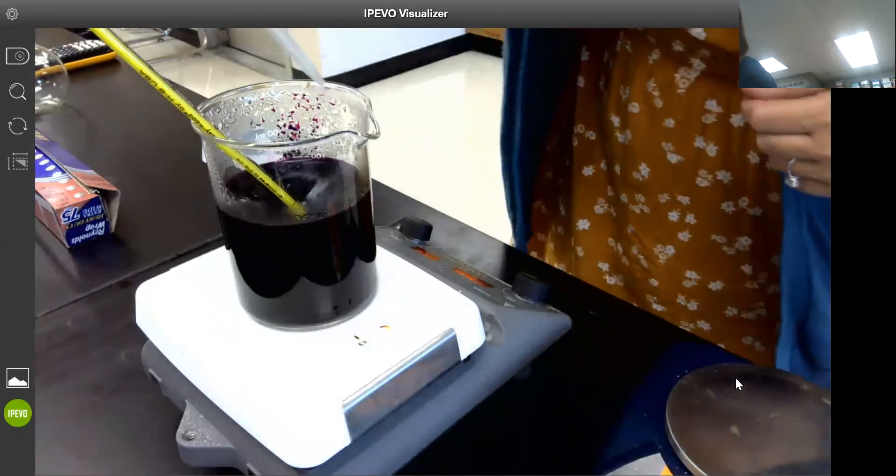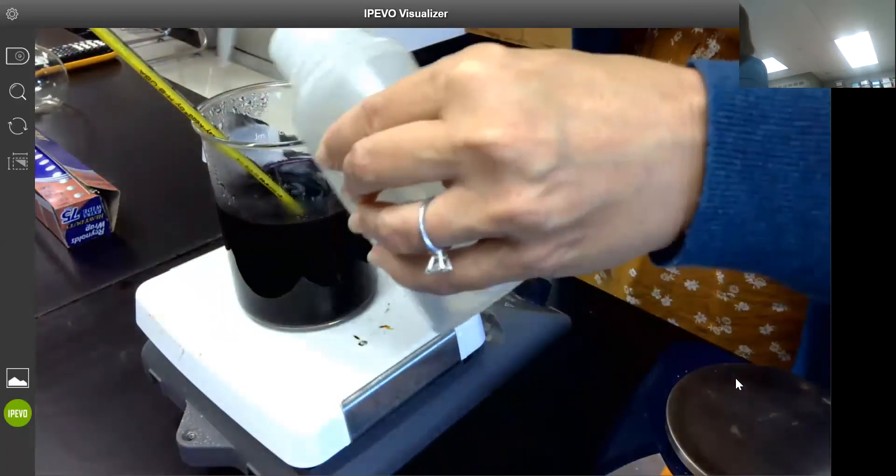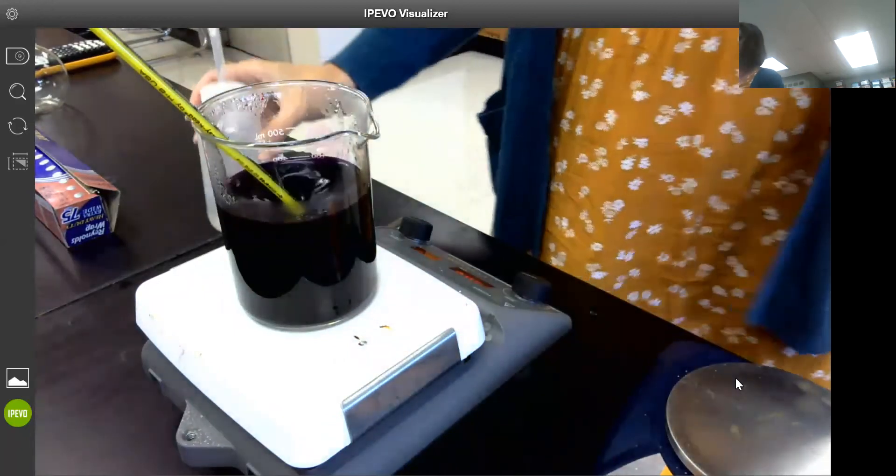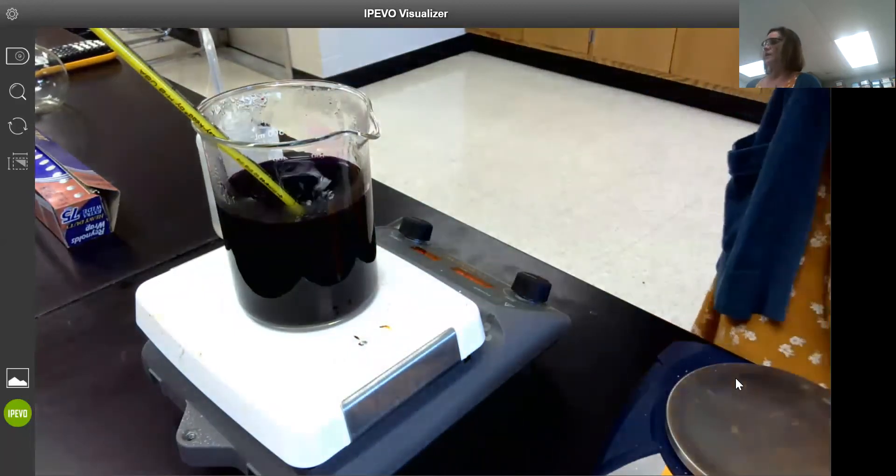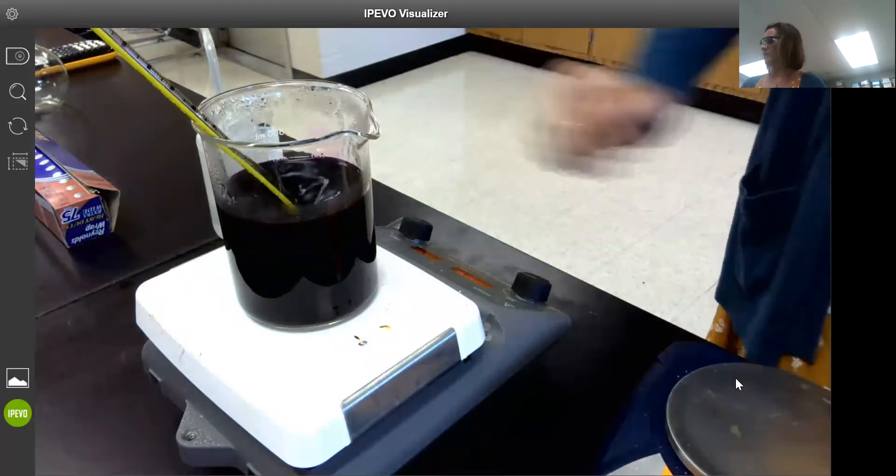I'm just going to spray down the sides to make sure all of the solid gets incorporated in there and dissolved. I also turned the heat way up so I want to get this all the way to 90 degrees with stirring.